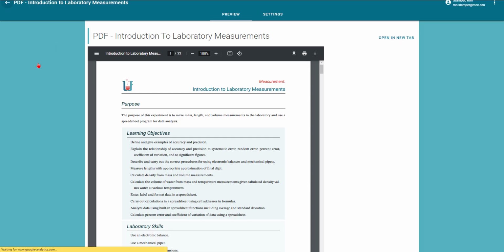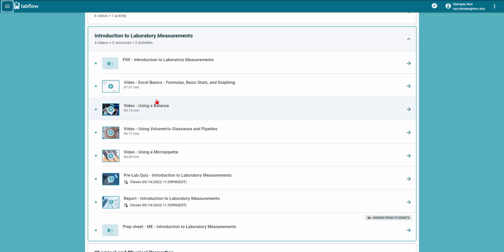So we go back here, we go back into LabFlow, and what we're going to see now, you would hopefully watch these videos so that you understand what's going on. The pre-lab quiz is here, which again, you will have to complete before you can go into the report. I don't have to because I'm the instructor and I can cheat.